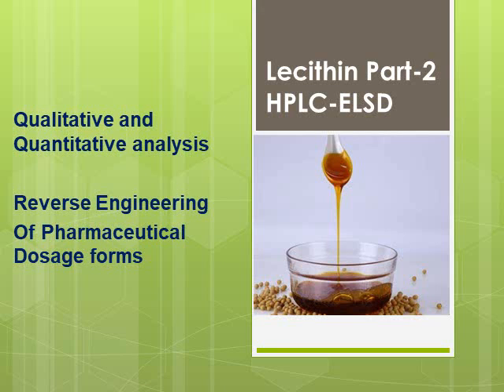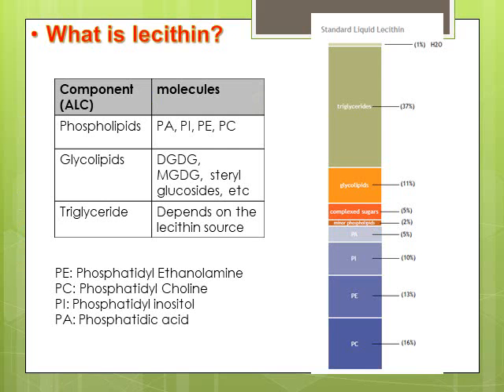Hello everybody, and thank you for choosing to watch another video on qualitative and quantitative analysis of pharmaceutical excipient. Today I'm going to talk about lecithin, and I'm calling it part 2. In part 1 I did talk about lecithin and did the quantitation and the study of this excipient using GC, and now in part 2 I'm going to show you data on HPLC with ELSD detector.